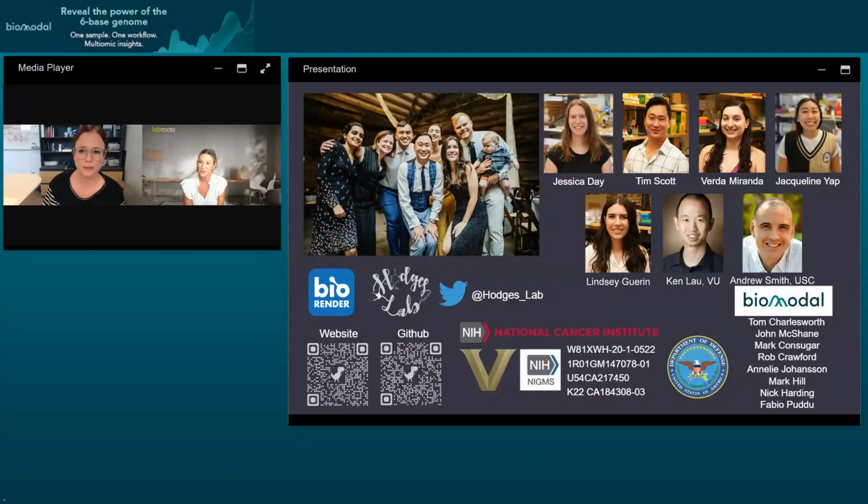Thank you. Now, could you please comment on how 5-HMC and or 5-MC represent RNA expression? Yeah, absolutely. Great question. There have been some studies, not by our lab, but by others, that have looked at whether you can also use 5-HMC or 5-MC to predict gene expression changes. We were able to show that we can predict accessibility changes using hydroxymethylation. And I think it's also true that you can do this with methylation and gene expression.